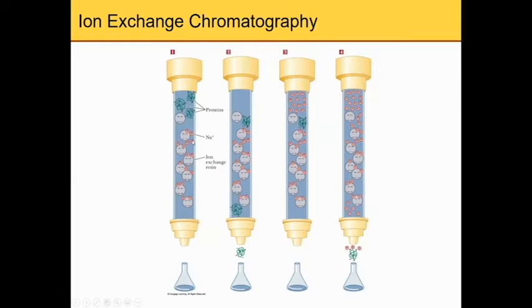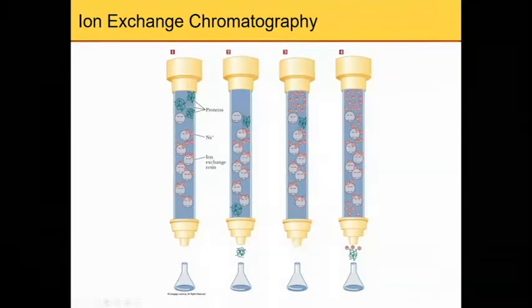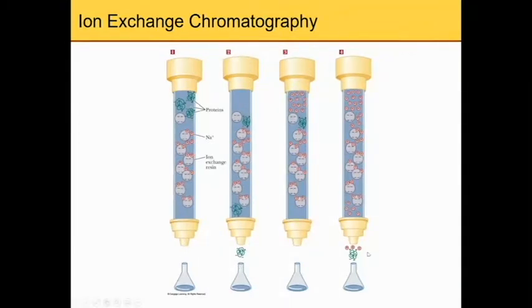All right, this is the cation exchanger. So there are sodium ions, all right, and the negative charge here. So basically, they will bind those positive side chains, all right, and the negative side chains will go through fast, and later on the positively charged side chains can be eluted. So this is the example of a cation exchanger.